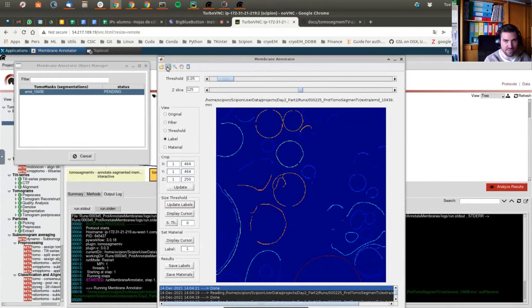Please, one question quickly. Is it normal that for the same Z slice as you, I see slightly different features, let's say different volumes? Are you in the same slice? Yeah, I think so. Maybe it was some different parameter, for example the sigma in the previous data. But let's continue, because maybe the values are a little bit different, but you get the final annotated structure the same as the rest. Let's try. If not, just tell me and we'll solve it.